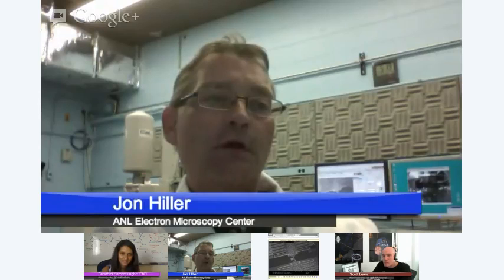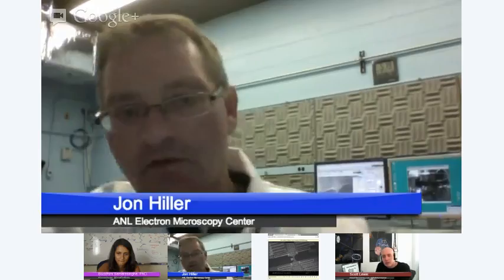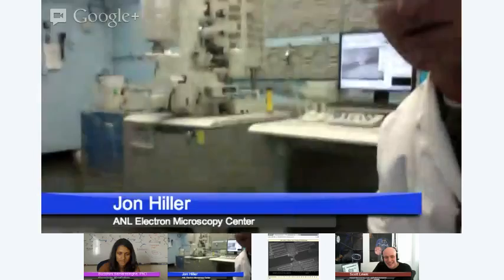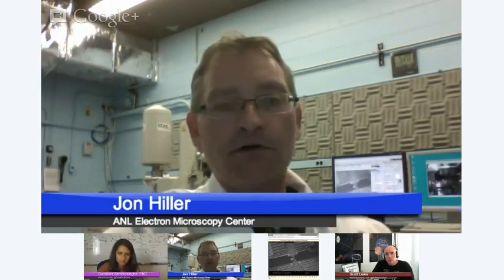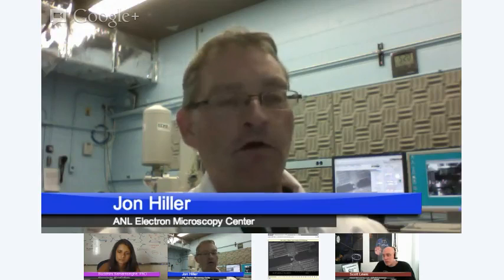The electron microscope, basically, I'm going to move off to the slide here and show you what one looks like. Okay, there is a typical scanning electron microscope. Just like an optical microscope uses light, the light interacts with the sample and you see a magnified image of it. However, the wavelength of light is so large that you can't resolve smaller things. The most you can get out of an optical microscope is 1,000 times magnification.